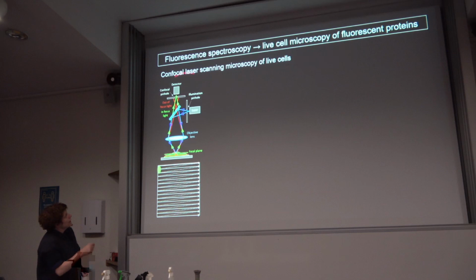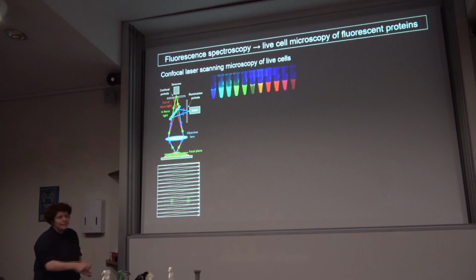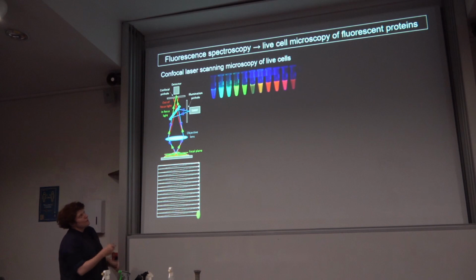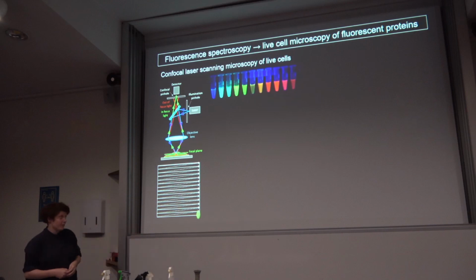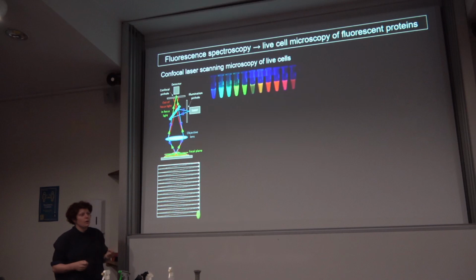And that's what a microscope offers. So here we have a laser scanning microscope, which essentially is what it sounds like. It has lasers that scan your sample in this raster pattern, and so in every pixel along this raster pattern, it excites fluorescence in your sample, detects the fluorescence, and then goes to the next one, excites, and then detects. And because we have this palette of fluorescent proteins, so I don't know how many of you are studying biology, but you might have heard of the green fluorescent protein. It was extracted from a jellyfish and has revolutionized cell biology. And essentially it enables us to go in and tag any protein we're interested in with any color shown here, and then we can visualize that inside a living cell.